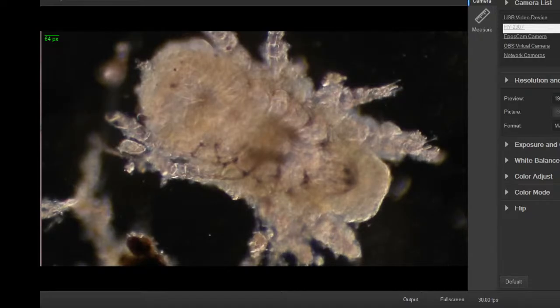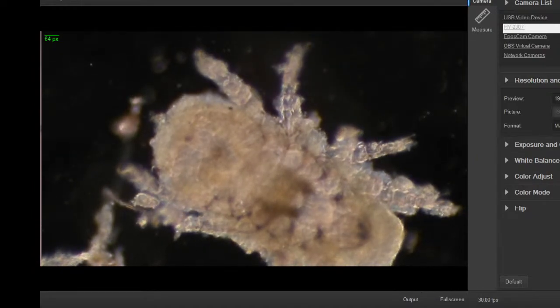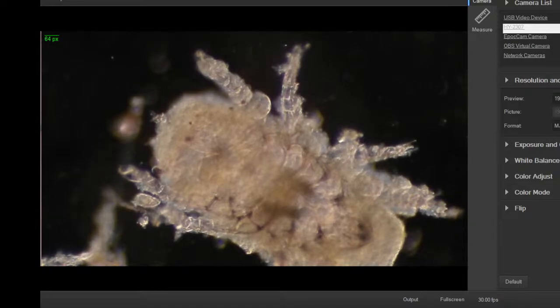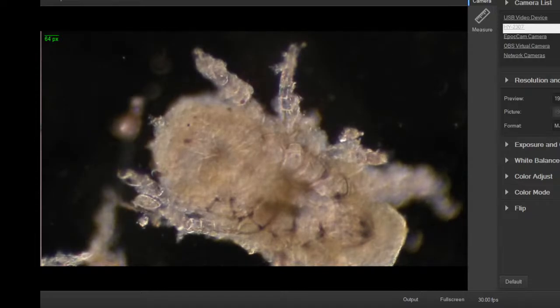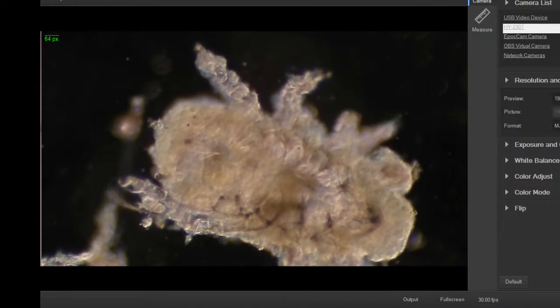Got a couple of ciliates poking around it too. There's one in the background there. Looks like one of those little Stylonychia guys. On the top part here, he's poking around, looking for goodies on the mite. That's pretty cool. Go find that tardigrade, because that's always a nice little specimen.